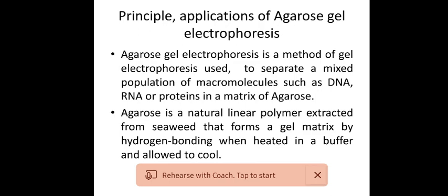The molecules that are positively charged are called cations, and they move towards a negative electrode called the cathode. Ions that are negatively charged are called anions, and they move towards the electrode called the anode, because ions move to their oppositely charged electrodes.